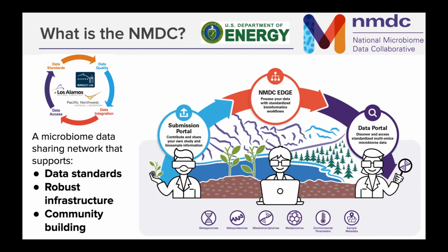So they have this standardized format where if you process your data through JGI or other facilities, you can actually have access to that template, and you can store your data in that format. We also have the NMDC Edge, which helps to process your data with its standardized bioinformatics workflows. Basically, everything you can do with NMDC Edge, you can also do in KBase.